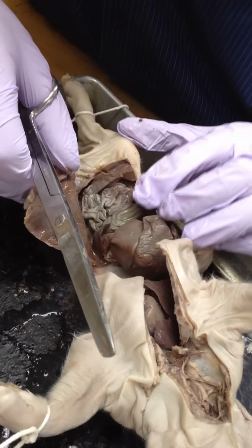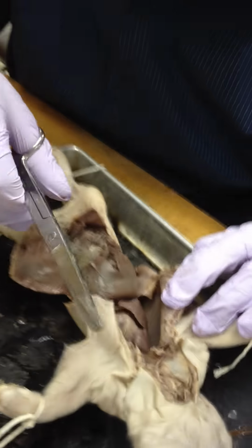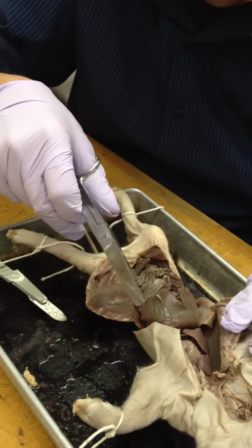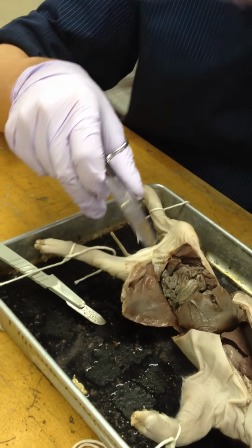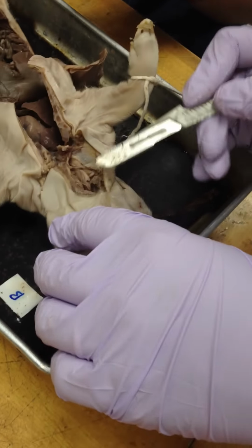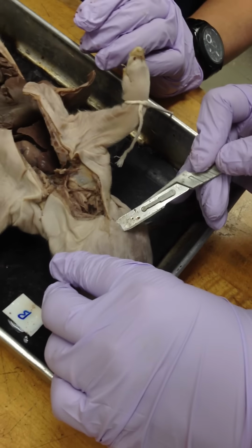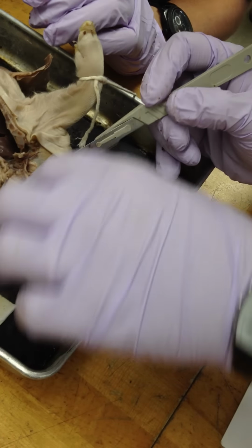All right, another thing that I was wanting to be able to see is if we could see the parotid glands. Ugh, there's that smell. Parotid glands? Where, you mean right by the face here? Right. Oh, geez. Okay. So if you were to continue, let me just see. It's a pretty sharp scalpel, so you should be able to get there.